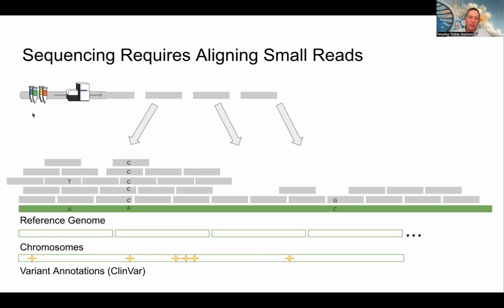And so what you can do to do that analysis is get a reference genome for that species. So say for instance, we're using humans. We have a reference genome for humans, and we take those sequences and we line them back onto the reference genome. And so here we have these sequences, or what we call reads. We read them from the genome. So these reads have piled up along the reference genome. And so with that, you can learn all sorts of different information from the genome.